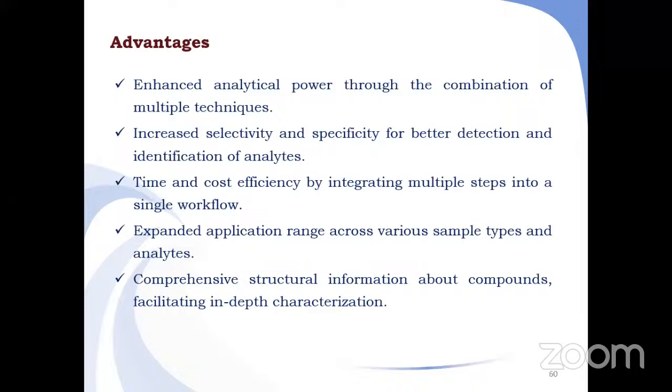Subsequently, the ionized compounds are introduced into the mass spectrometer for precise mass analysis. So LCMS consists of an HPLC unit, the LC, with a mass spectrometer detector attached. Whereas in the case of exclusive HPLC, it allows the physical separation of the components. MS measures the mass to charge ratio of the ionic species, which is not related to HPLC.